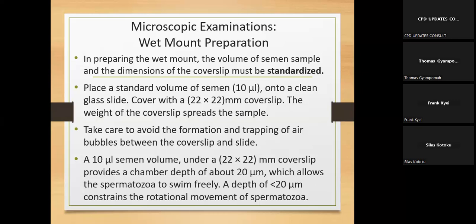The cover slip we use in microbiology and hematology is the same cover slip, but they have various specifications and sizes. The normal size we use in most of our labs is the 22 by 22. You can have 22 by 32, 22 by 40, 22 by 50, but those are not useful or needed in, let's say, hematology. Hematology, what are you doing? Sickling. And then you go and use a 22 by 40 cover slip.